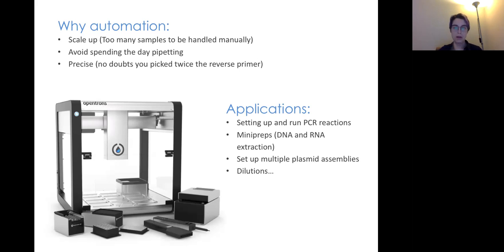So you have to pipette one template DNA and then two pieces of DNA, which anneal at the end of what you want to amplify, and you add the enzyme, and the enzyme uses these pieces of DNA to just copy. It's just copy paste, basically, the PCR. You have a piece of DNA, you want to copy one part, paste and amplify it and make loads. Or the miniprep, which is basically just extracting some DNA.